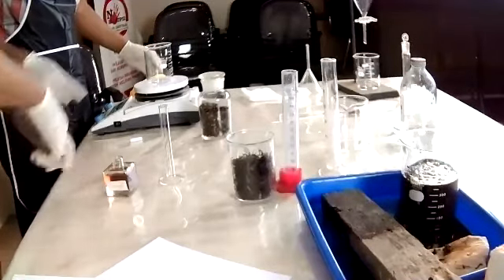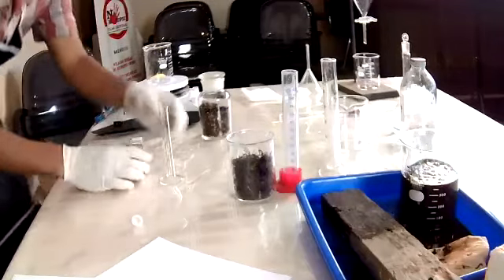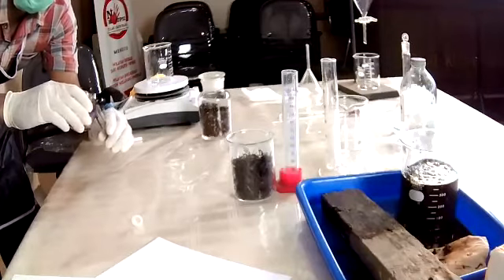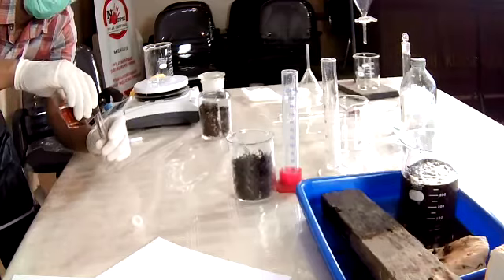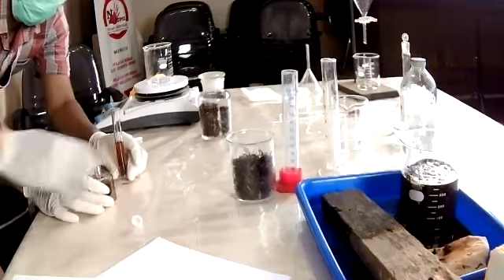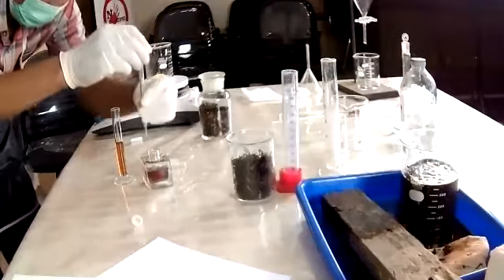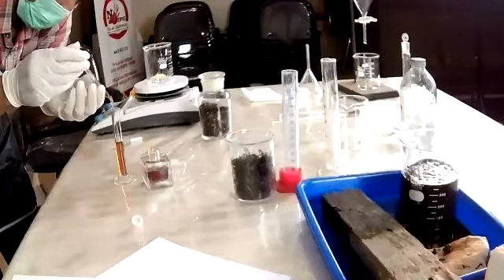We use about 10 milliliters for this purpose. It depends on how much end product you want to have and to use. This is 10 milliliters.